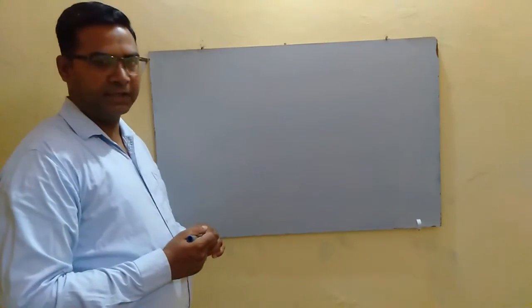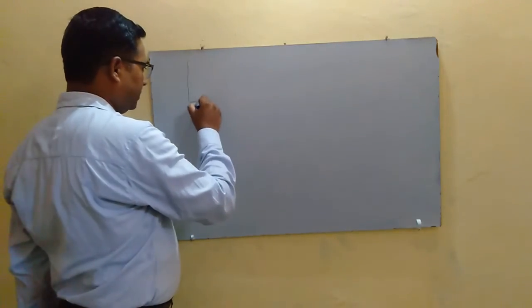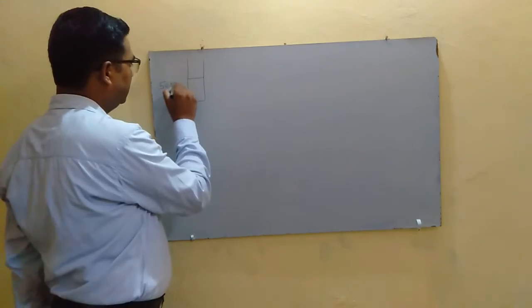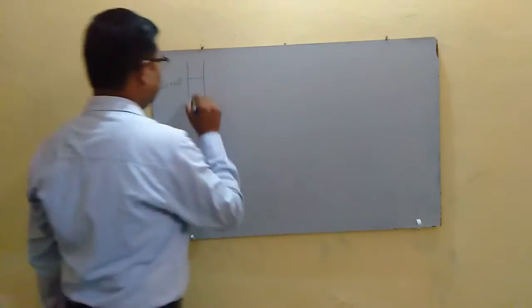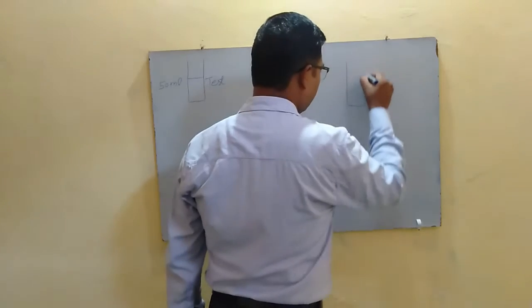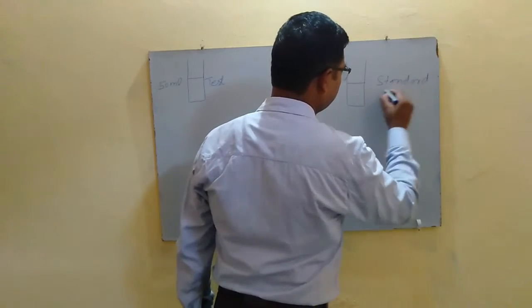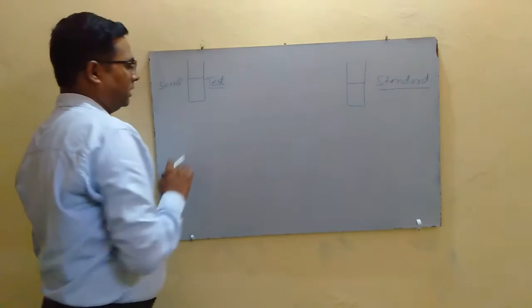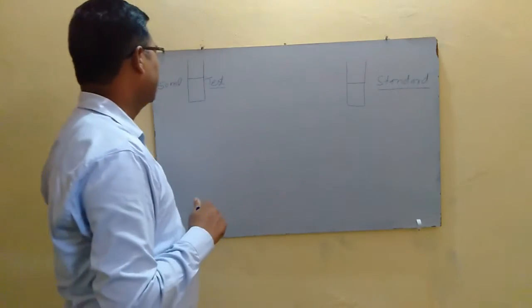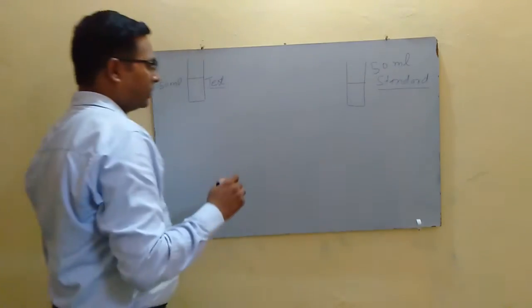We have to take two Nessler cylinders, one for the test sample and another for the standard. Both Nessler cylinders used here are of 50 ml capacity.